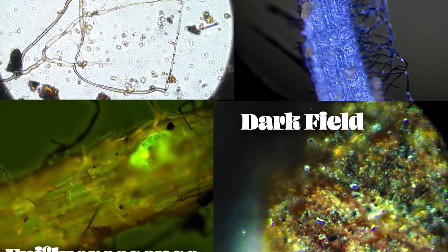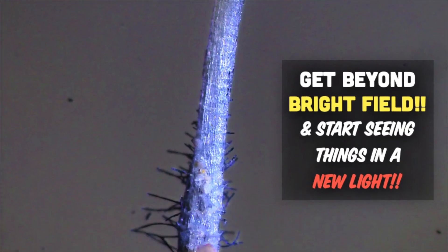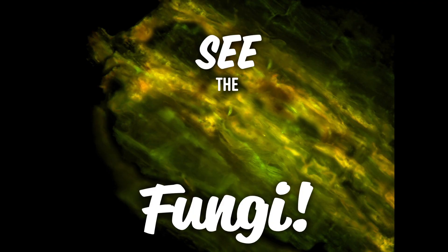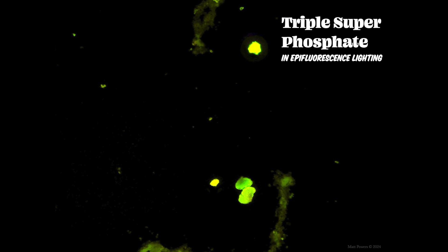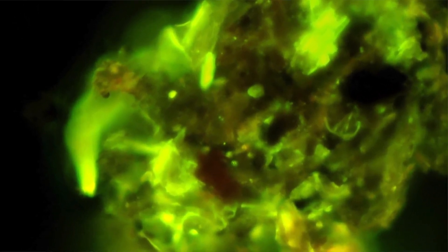Not just brightfield — we'll go beyond brightfield. You've waited long enough. There's darkfield, there's epifluorescence so that you can see the fungi, so that you can see where phosphorus goes and glows, and also biological stains. So you can verify that things are actually active and without the freezing, without the liquid molten agar. These are living samples that are just diluted 1 to 100 and then stained. It's incredibly easy, it's so fast, and it's an all new method.